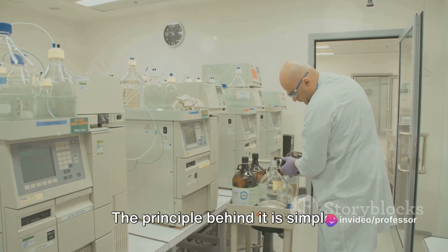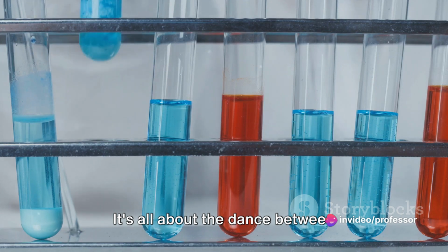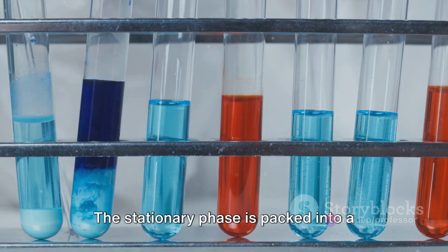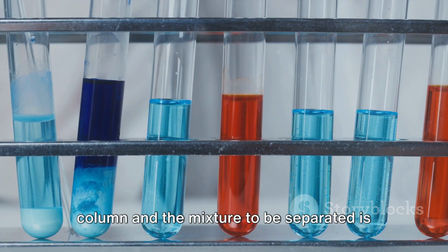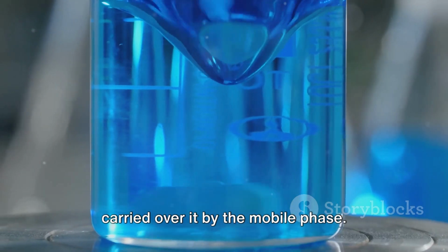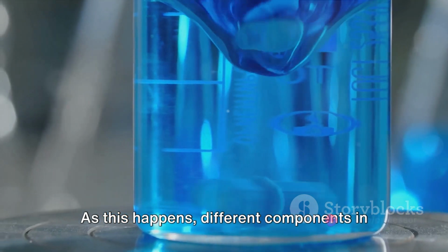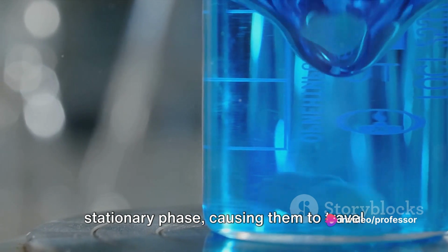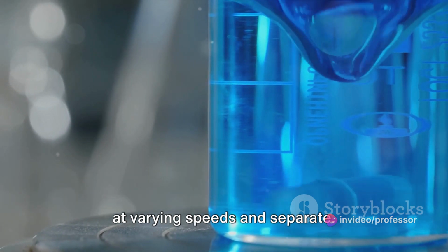The principle behind it is simple. It's all about the dance between stationary and mobile phases. The stationary phase is packed into a column, and the mixture to be separated is carried over it by the mobile phase. As this happens, different components in the mixture interact differently with the stationary phase, causing them to travel at varying speeds and separate.